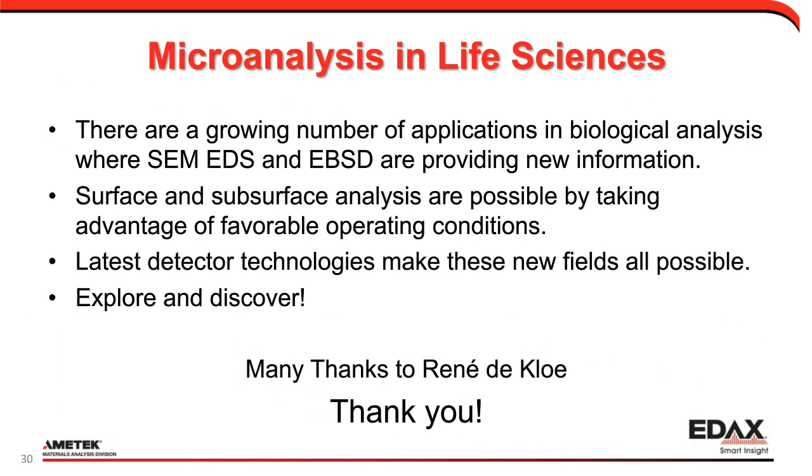Okay, so that concludes our final example of our EDS and EBSD life science applications. In summary, there are a growing number of applications in biological and life sciences where SEM, EDS, and EBSD are providing new information. So we just have to go out there and explore what those applications are, and certainly when we do, we find some really interesting examples.